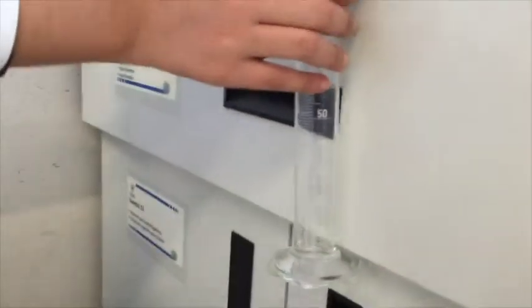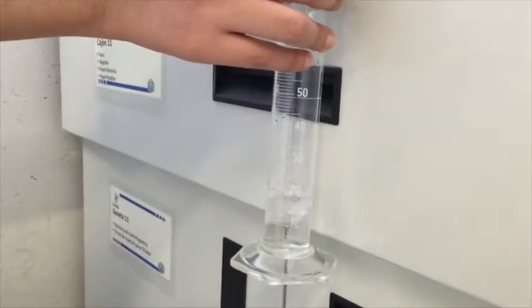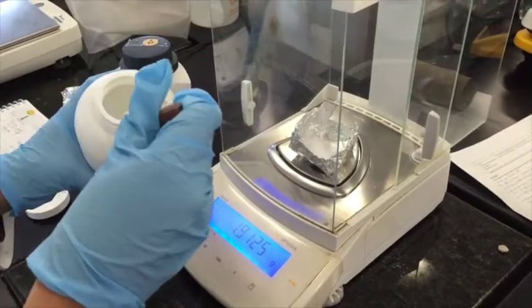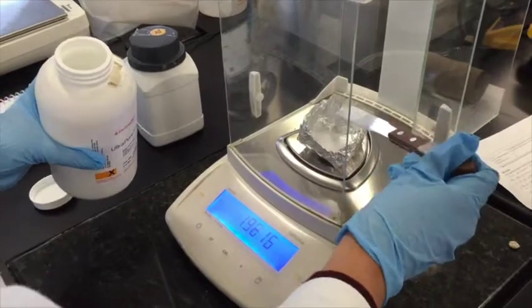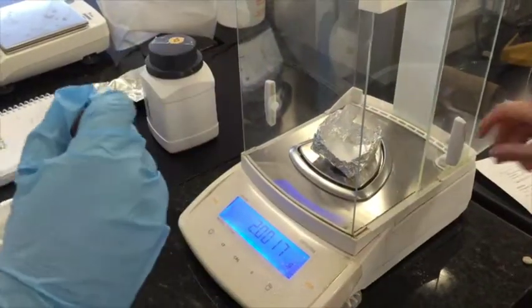In order to prepare 20 milliliters of SDS at 10%, 2 grams of SDS were weighed. Then, in a Falcon tube, distilled water and SDS were mixed carefully. This step was important because SDS is a detergent, so we do not want to make bubbles.